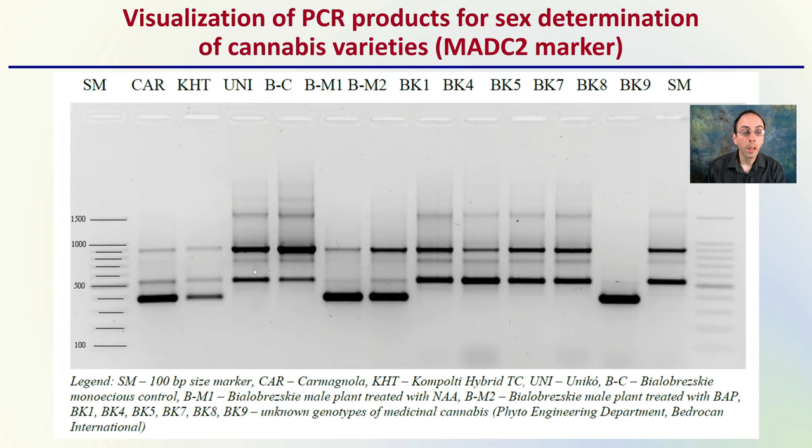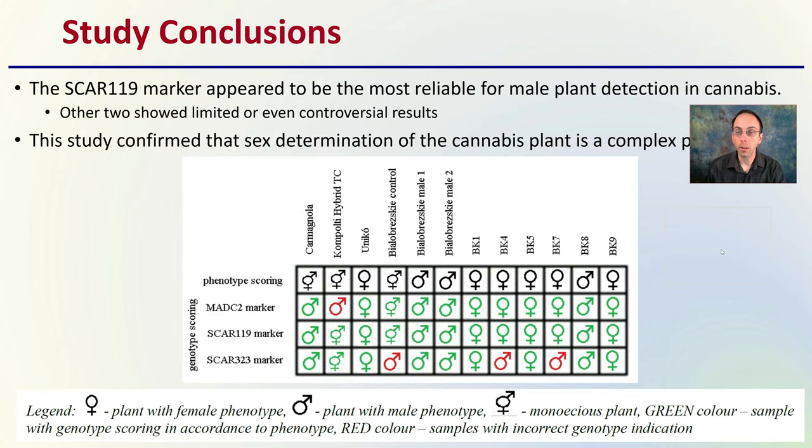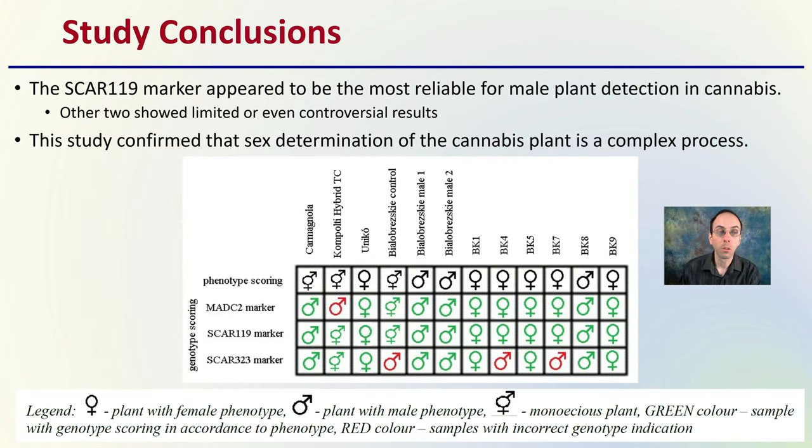The first DNA was put, and then these smaller bands can travel further through that gel. And you see the data presented here from the research study mentioned earlier. Now we look at the conclusions of the study. So that's the actual data. Well, let's get to the conclusions.